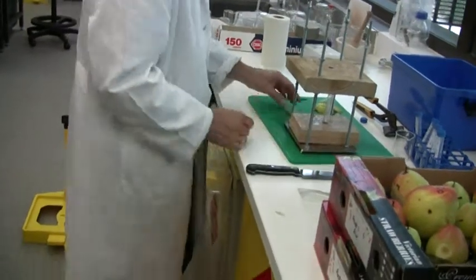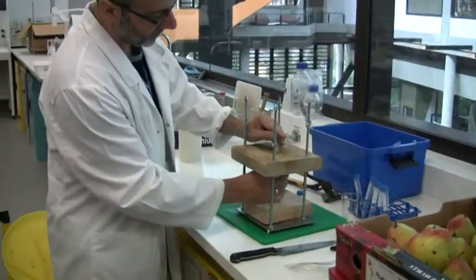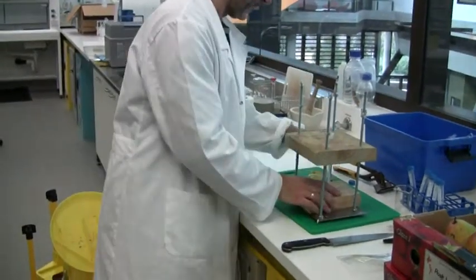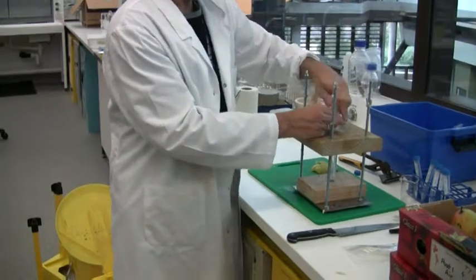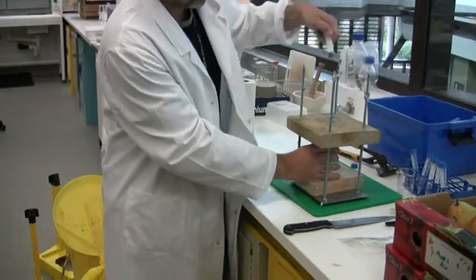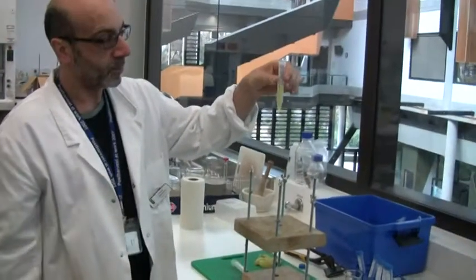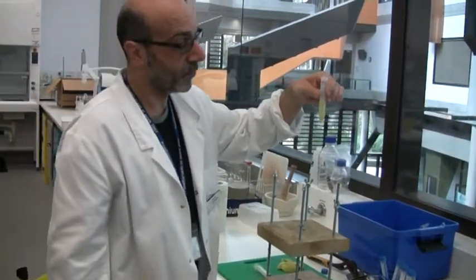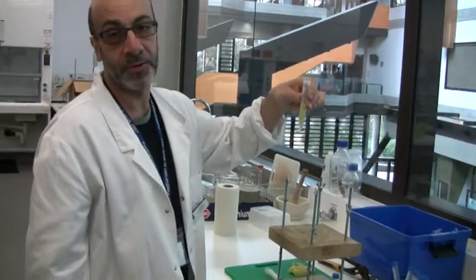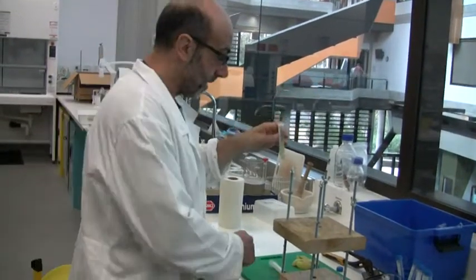So our little press, so we collect the sample over here, the syringe there, so it sits on top of the Eppendorf, and squeeze. Out, sample's gone, that's our sample there. And we'll spin that for 40 minutes at about 4,000 RPM and collect the juice out of that, and that gives us an idea of how much of the expressible juice and eating quality again.